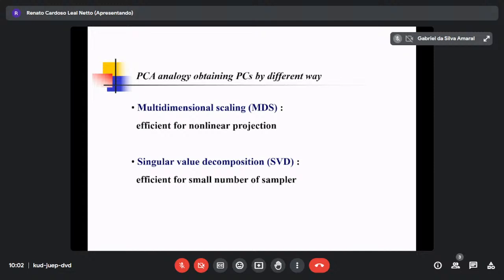So my suggestion is, if PCA is not enough, then you can go to a supervised method like PLS, OPLS, SIMCA, whatever. Or the best way is, please increase the number of samples. I hope that helps, Lucia.